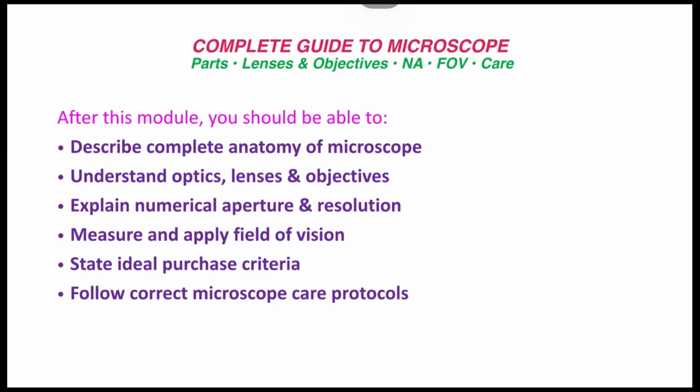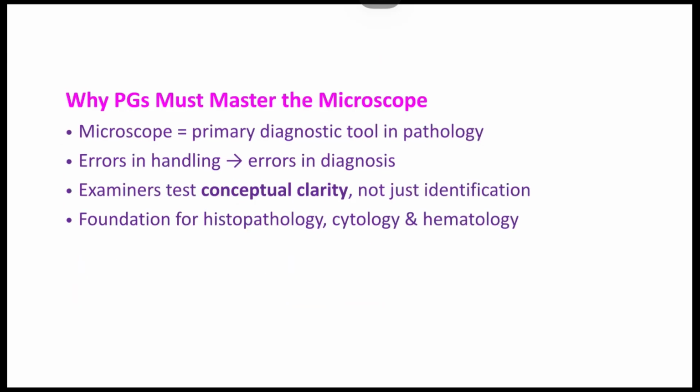We will understand optics, lenses and objectives. What is numerical aperture and resolution? Measure and apply field of vision and follow correct microscope care protocols.